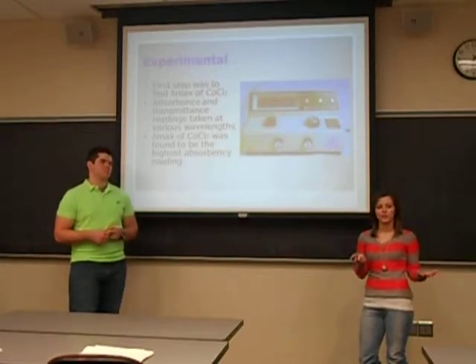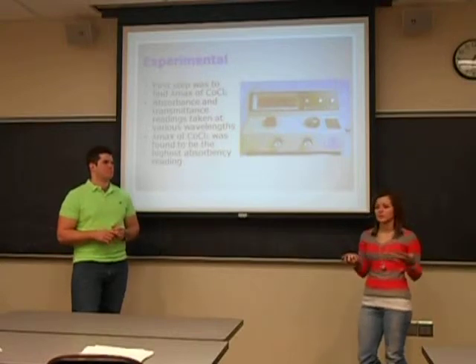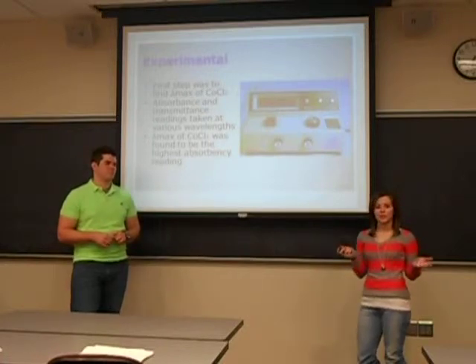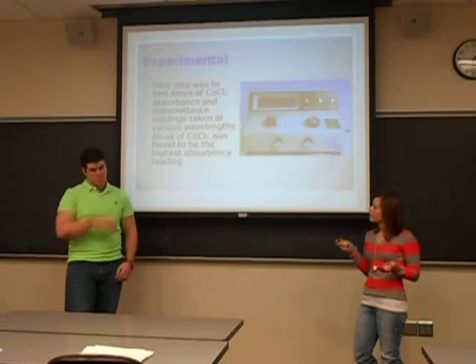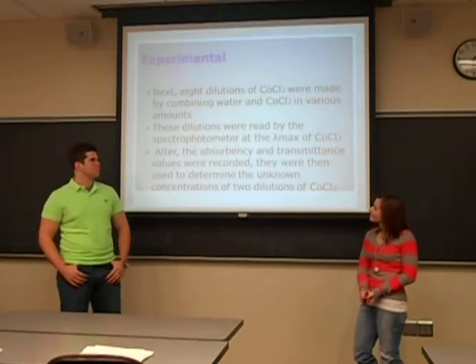We started at 400 nanometers of light, and we measured all the way up to 600 nanometers of light by increasing increments of 25. And the lambda max was found at the highest absorbance reading, which was 0.806, and our lambda max turned out to be 500 nanometers.